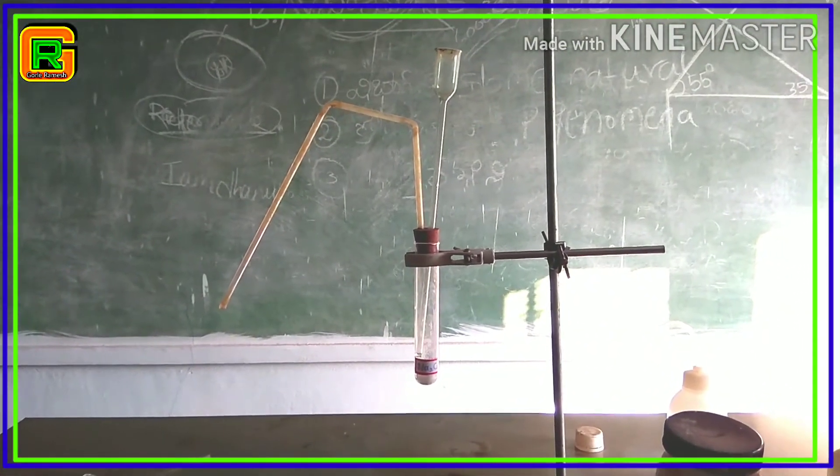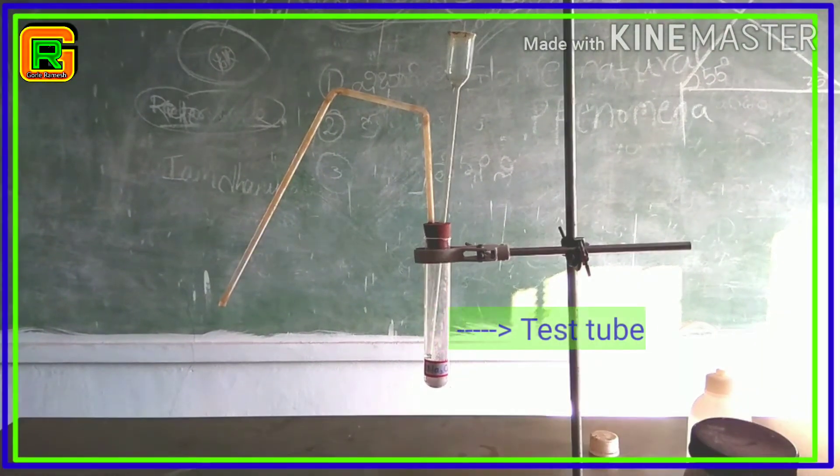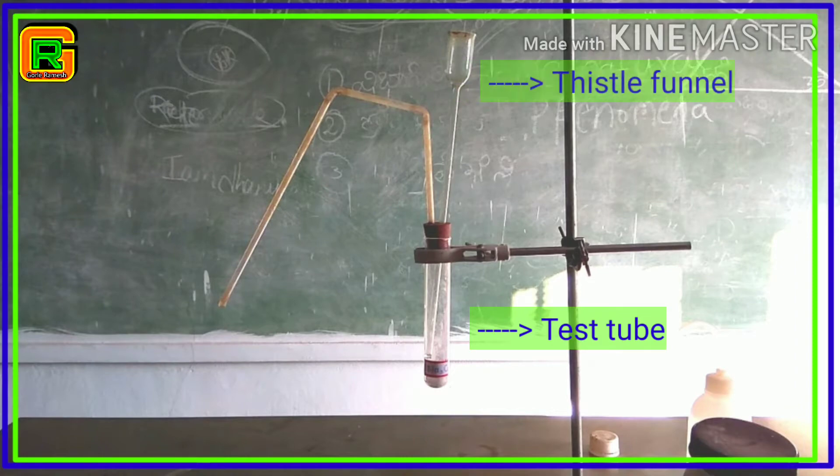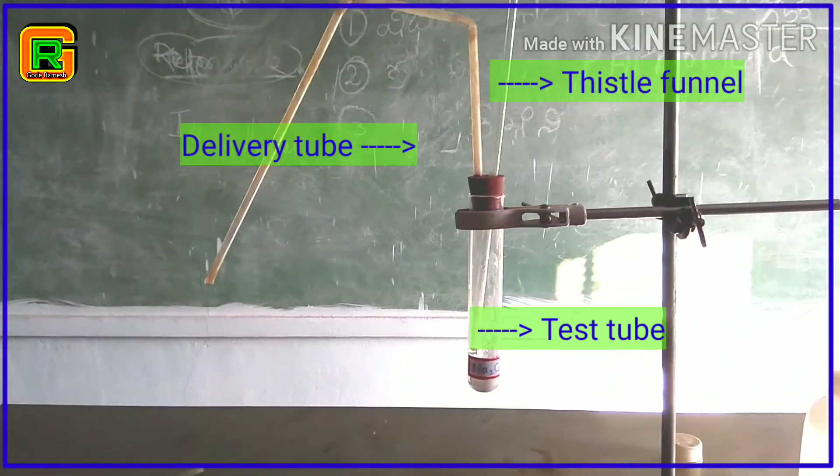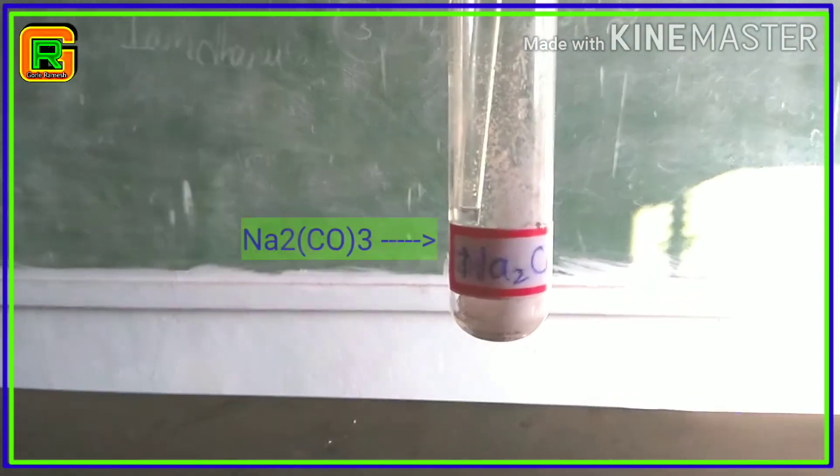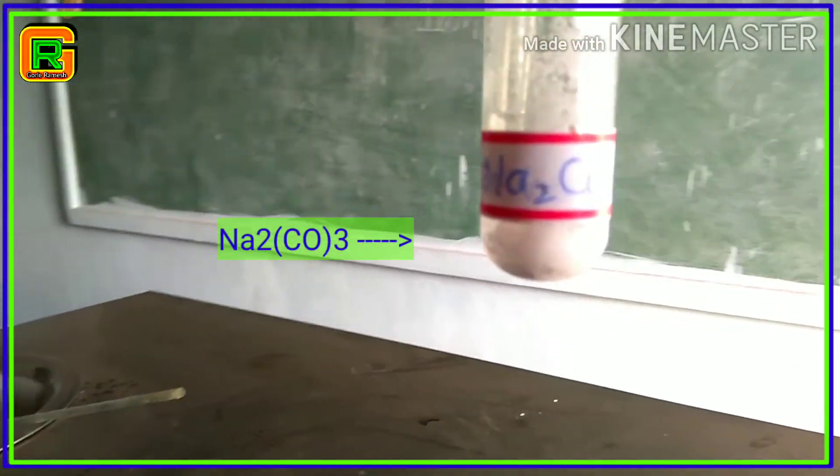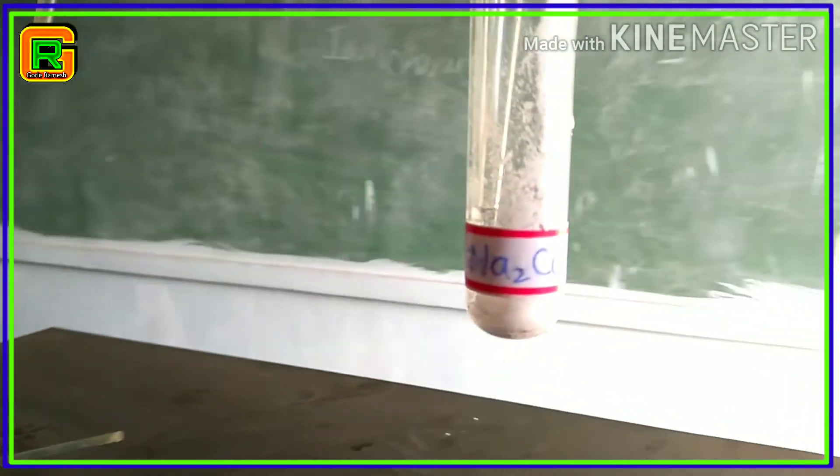Arrange the apparatus as shown in the figure. This is test tube, this is thistle funnel, and this is delivery tube. First of all, take a small quantity of sodium carbonate in the test tube, that is Na2CO3.